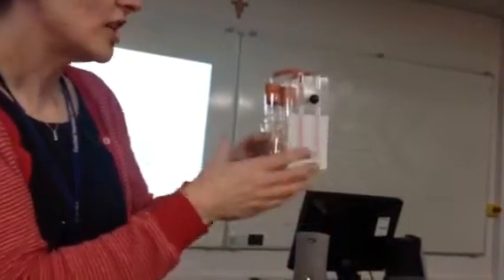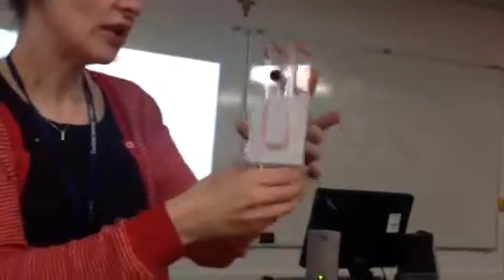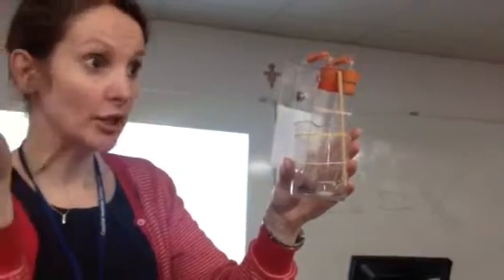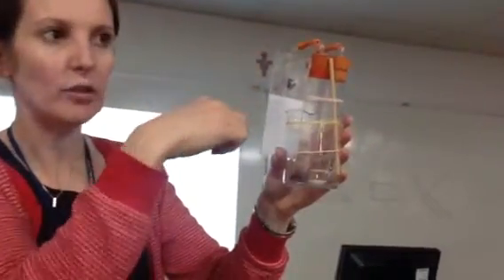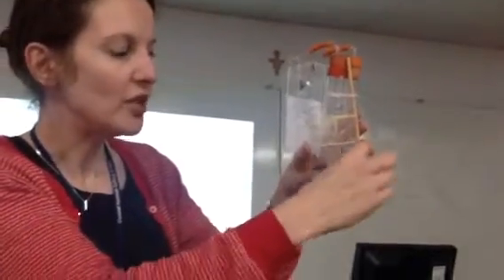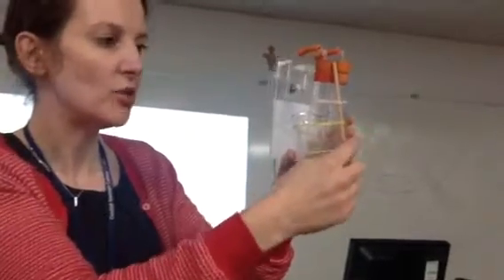So this is called a respirometer, and we can use it to measure oxygen uptake in peas, in maggots, in locusts, any organism. So you would put the organism in this side with some potassium hydroxide, and then in this tube, so that it's a closed system, and that means that there's no influence from the atmospheric oxygen and pressure into the system, so any changes in the fluid movement are purely due to the respiration in here. In this tube, I therefore put the same volume as the volume of organisms of water, fluid and potassium hydroxide, so that any carbon dioxide is just being absorbed.